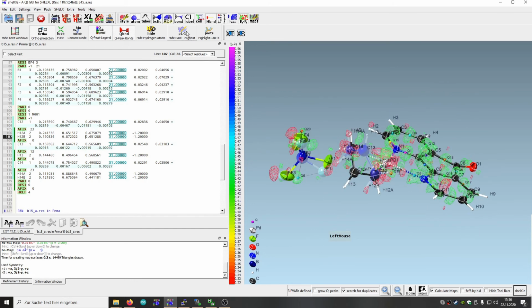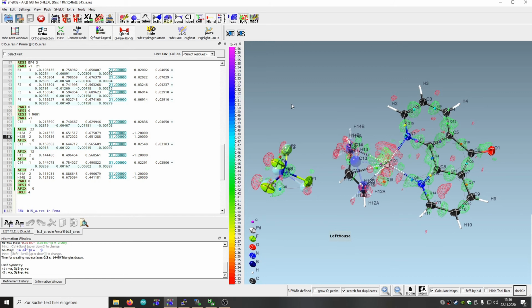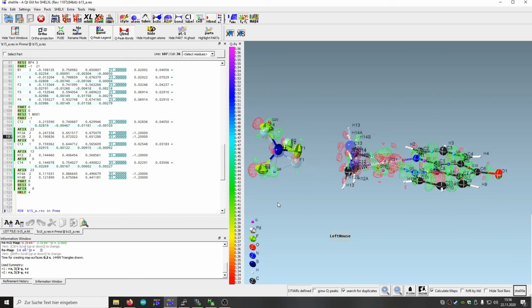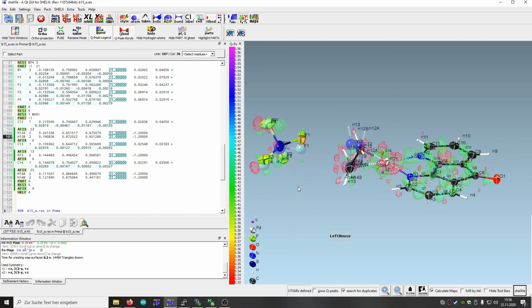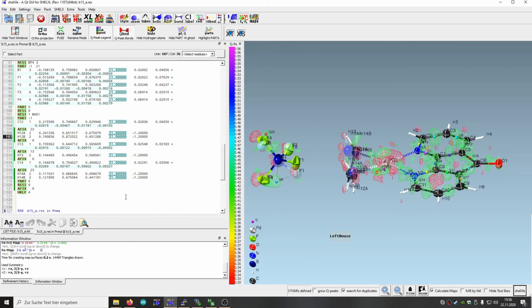If you don't like those ghosts, you can click here to hide them, and with that we can highlight those extra parts. Yeah, so in principle, if I put more effort, I probably could move that a little bit so it fits the residual density of that BF4 entity a bit better. Just playing around a bit would help.